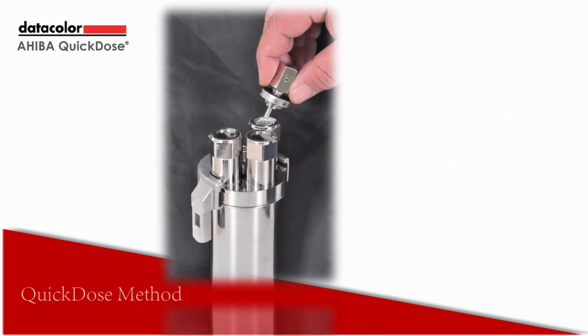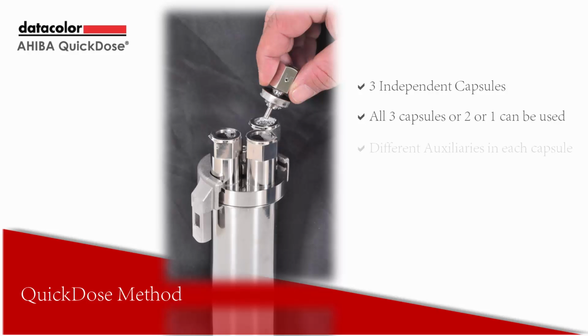In the Ahiba Quickdose method of operation, each lid has 3 independently operated capsules mounted to the dyeing lid. The use and operation of these capsules is quite simple and flexible. Depending on the specific needs, the user can choose to use all 3 capsules, or 2, or only 1. The user can choose what auxiliary to use in which capsule. The only limitation is volume. Each capsule can hold approximately 5 grams of powder or 7 milliliters of liquid.